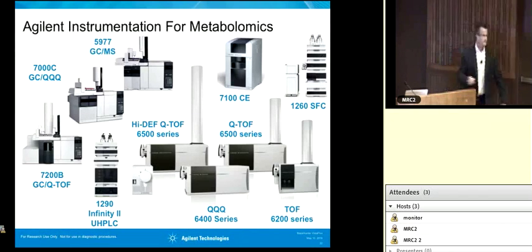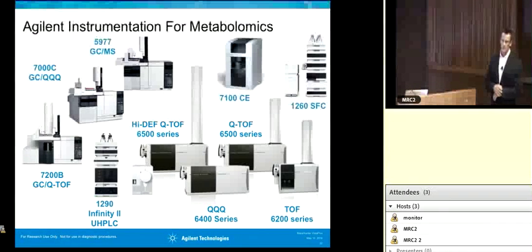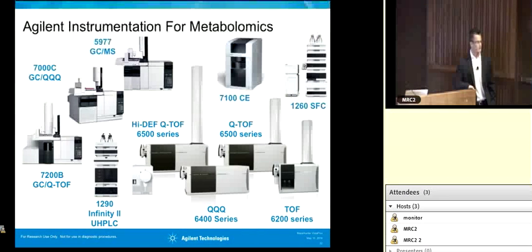So at this point, I want to talk first verbally about how we're extracting the data, the isotopologs, and then we'll go into an actual example because this is kind of complex, and it's really good to look at this in a couple of different ways. From the target list that we had, where we said, here's my 15 metabolites, and I'm using a C13 tracer, the software is going to go through and calculate what each possible isotopolog could be. It'll then extract the chromatogram for each one of those possible isotopologs along with the specified retention time that you gave it.